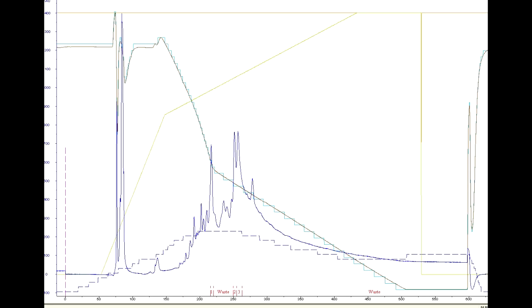And finally, when the third peak was finished, we hit zero and pressed execute, and the rest is waste.